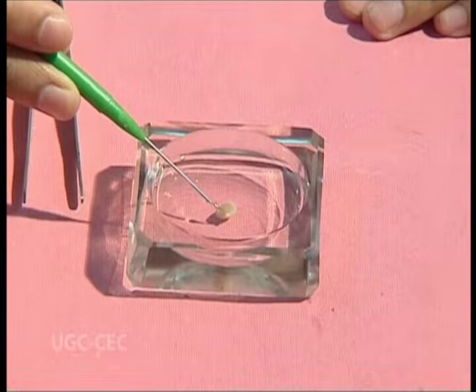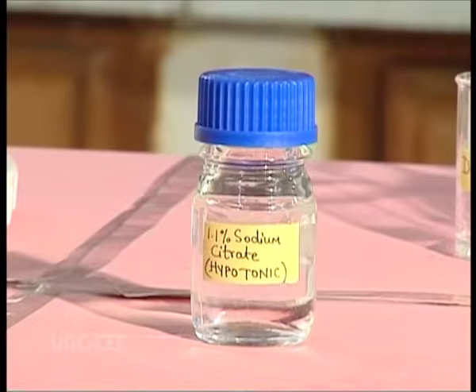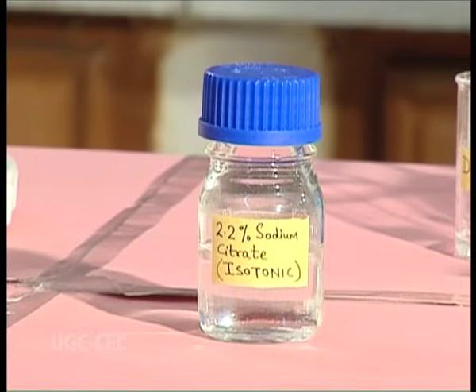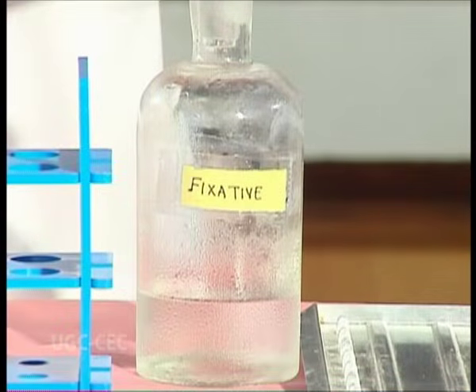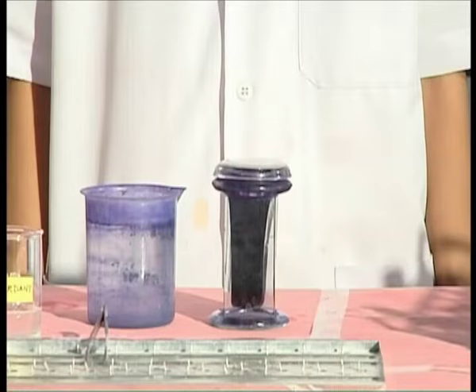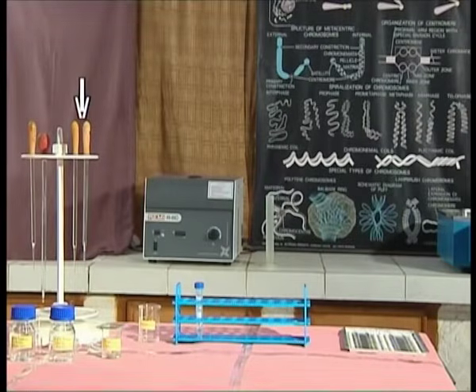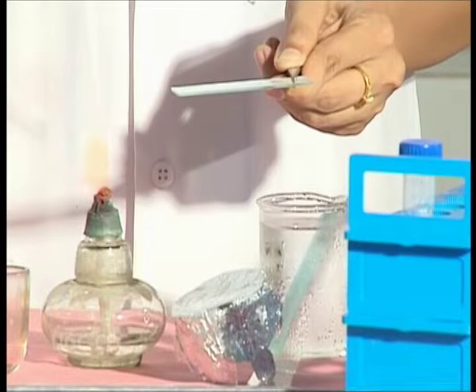The materials required here are rat or mice testis, hypotonic solution, that is 1.1% sodium citrate, isotonic solution, that is 2.2% sodium citrate, fixative, that is 1:3 acetomethanol, freshly prepared and chilled, 2% Giemsa solution, centrifuge tubes, Pasteur pipettes, slides, etc. Now, we shall talk about preparation of solutions.